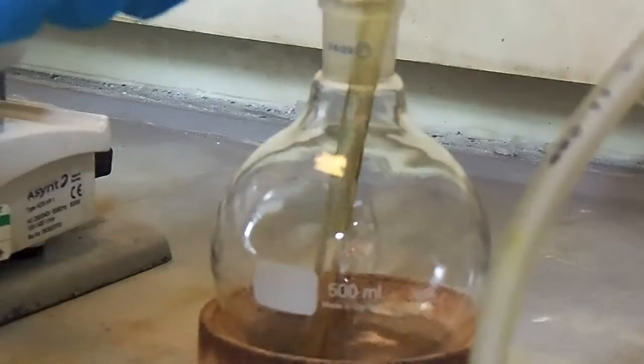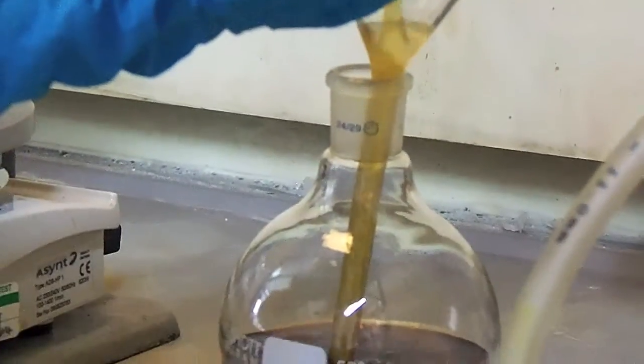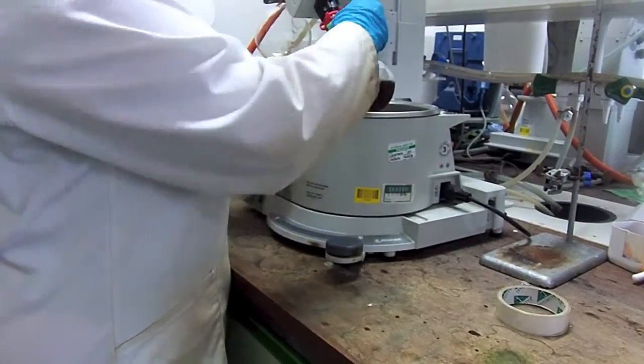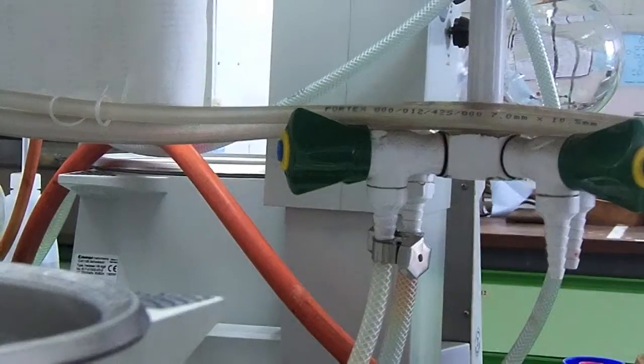First of all, you need to pour your pyrrole into a round-bottom flask, filling it no more than half full. If you're not confident in your ability to do this, you can use a funnel, as you can see here. Once you've done this, you need to put the flask on a rotary evaporator which you've cleaned beforehand, and then clip it securely so it doesn't fall off.